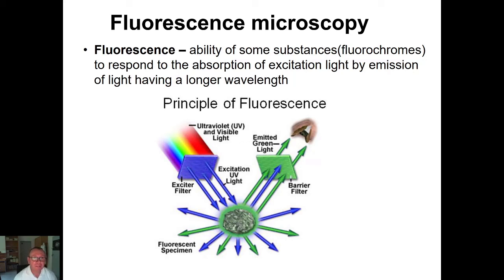Maybe you know that there exists a physical phenomenon of fluorescence, which is the ability of some substances, which are called fluorochromes, to absorb light and to respond to this absorption by emission of light of another and longer wavelength.